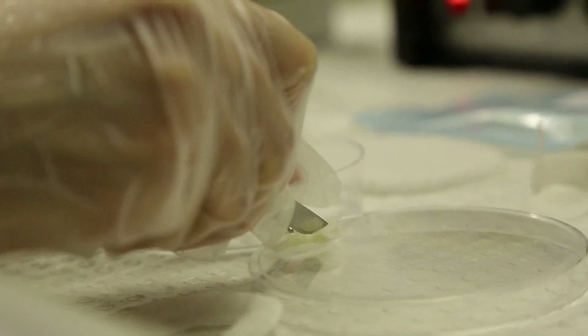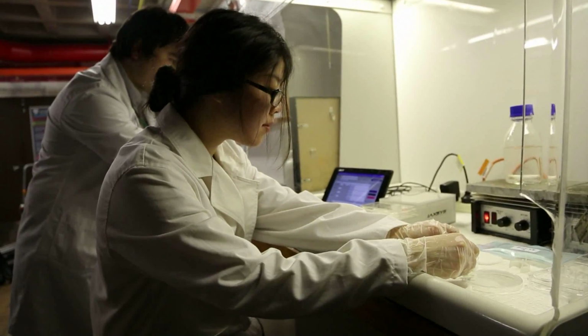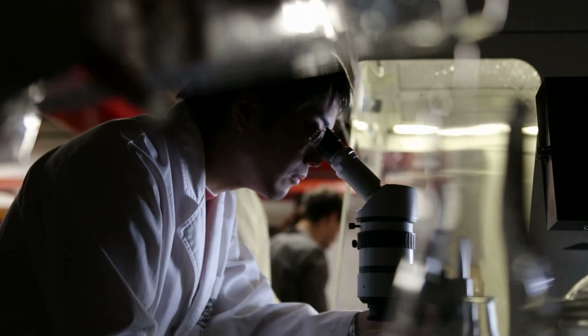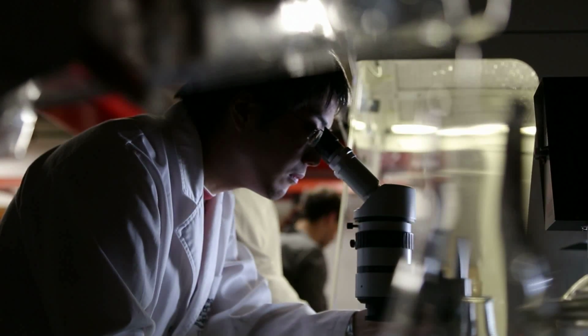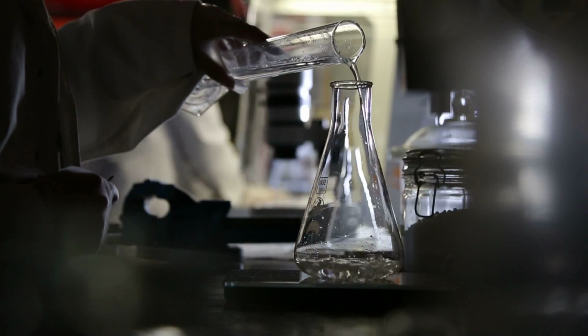Scaffolds, which when implanted in the body, turn into skin or turn into cartilage in a matter of a few weeks or months. And we're leading the world in the area of developing scaffolds for regenerating diabetic ulcers. This is a very interdisciplinary activity. In fact, a lot of our collaborators are from the Faculty of Medicine. As well as that, there are the experts who work in the microscopy area that we work with. Again, microscopy is a very advanced discipline, and we work very closely with the microscopy unit as well.